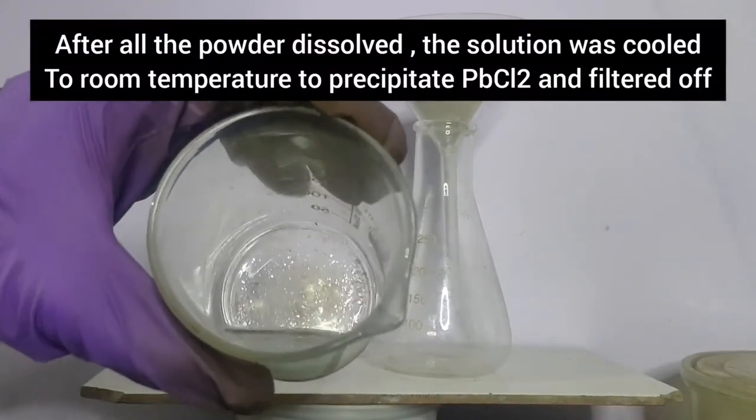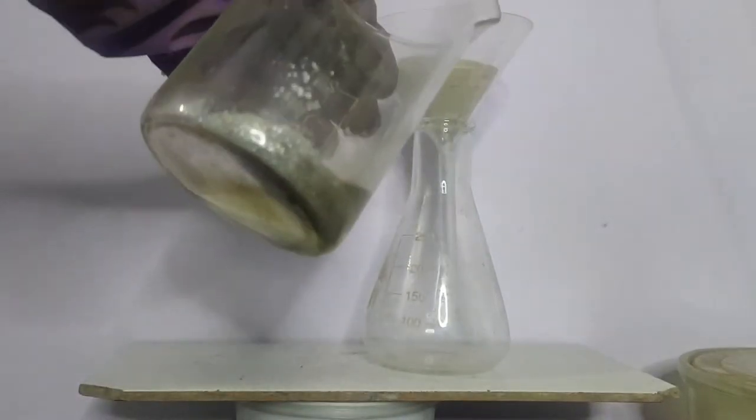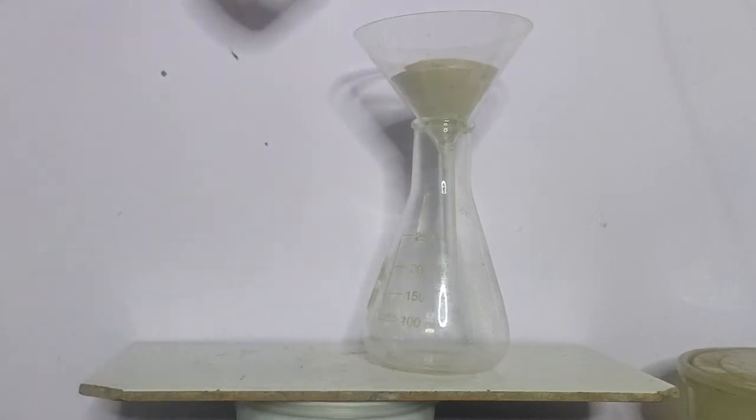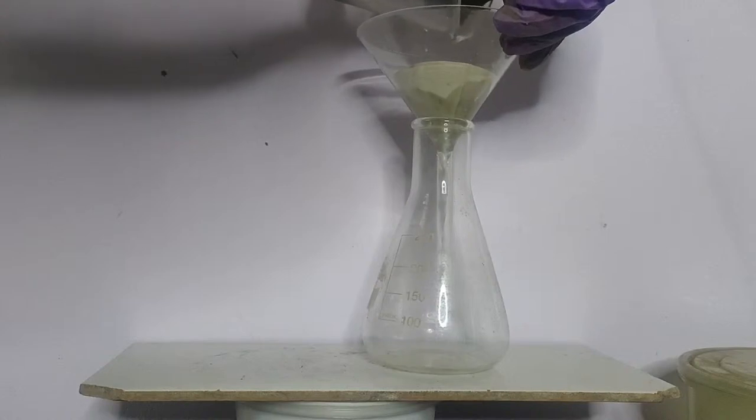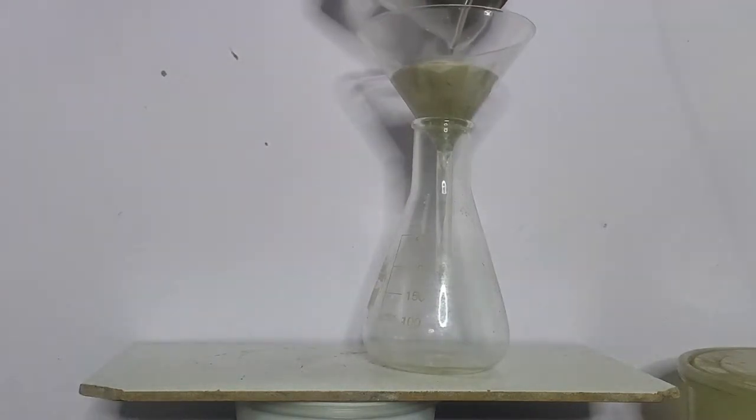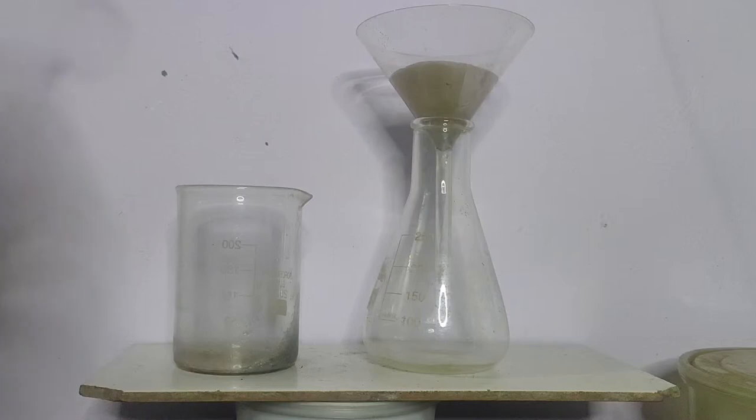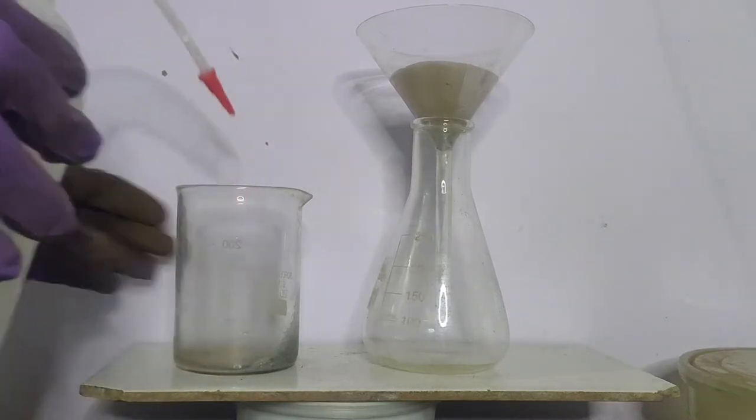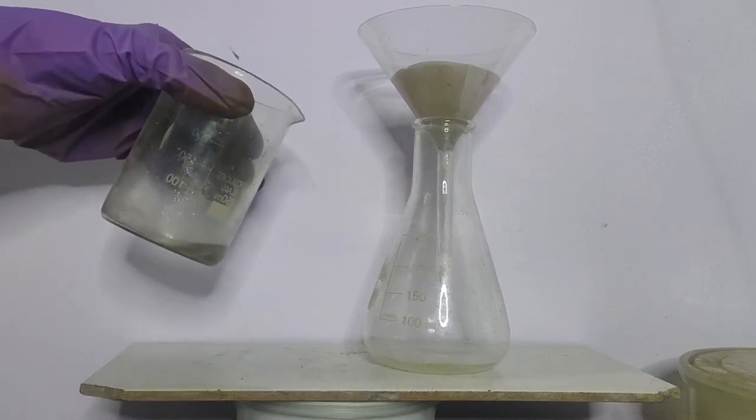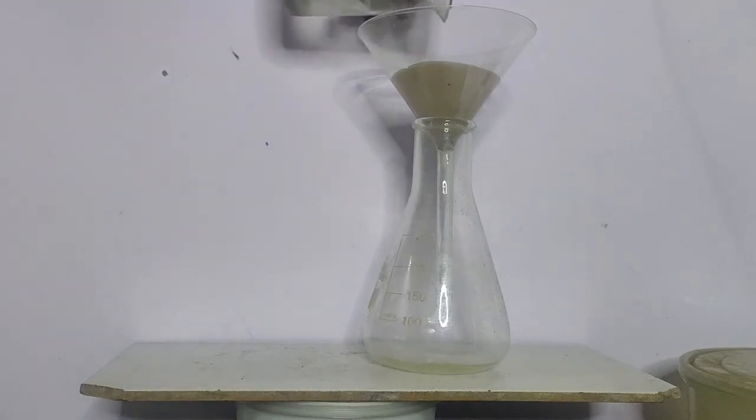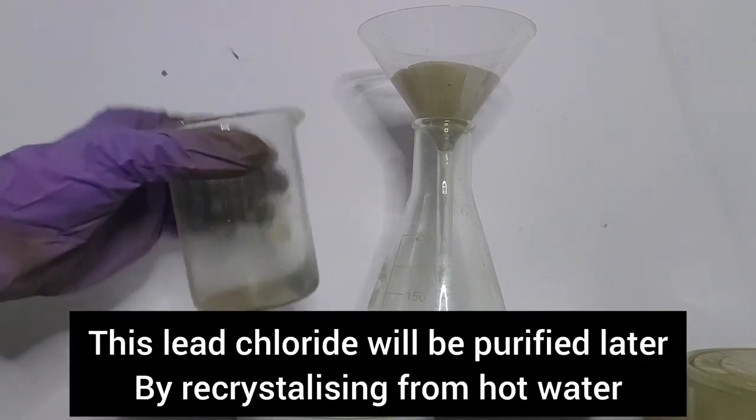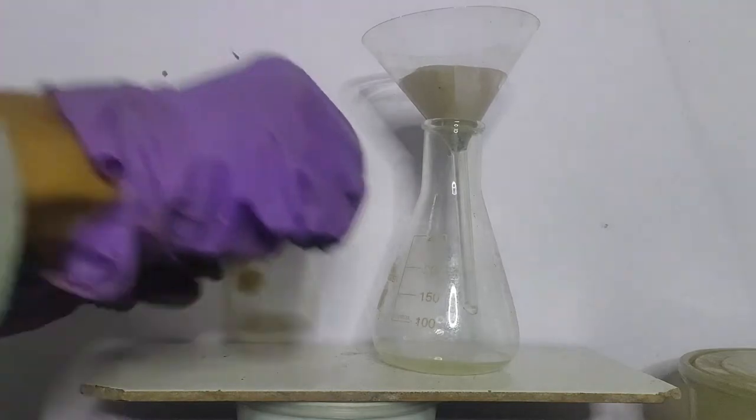So now, when after all the powder was dissolved, the solution was cooled and the lead chloride crystals, which were formed, were filtered off. I washed the lead chloride with some distilled water. This lead chloride will be purified by recrystallizing from hot water.